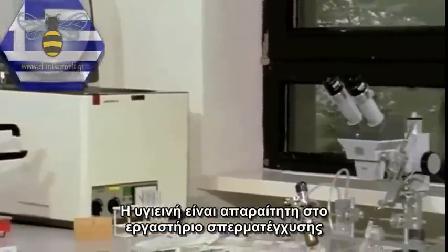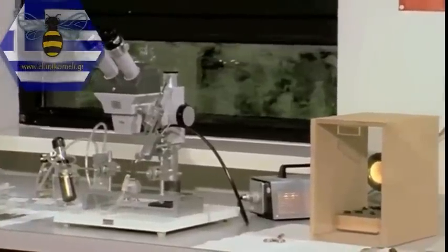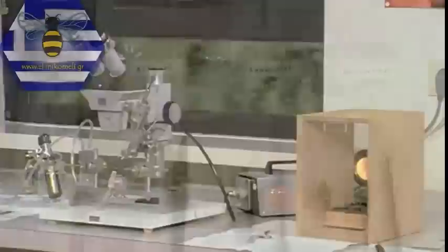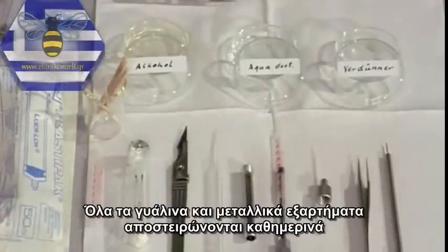Hygiene is essential in the insemination laboratory. All glass and metallic instruments are autoclaved daily.